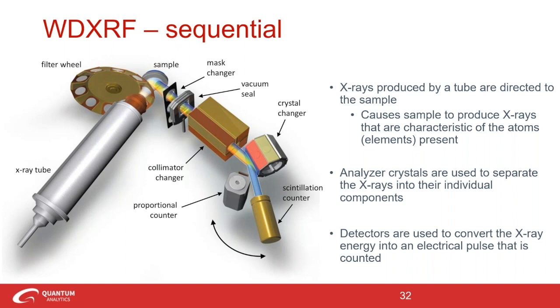Many of you probably have heard of Bragg's law. It's a constant in a lot of spectroscopy technologies, right? So this states that crystals will reflect X-rays of specific wavelengths and incident angles when the wavelengths of scattered X-rays interfere constructively. While the sample position is fixed, the angles of the crystal and detector can be changed in compliance with Bragg's law so that the specific wavelength can be measured.